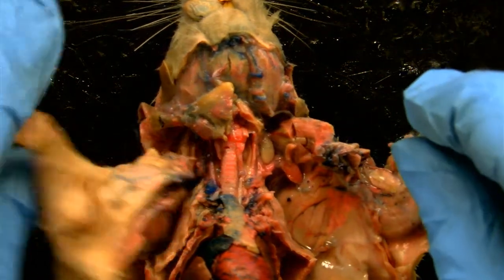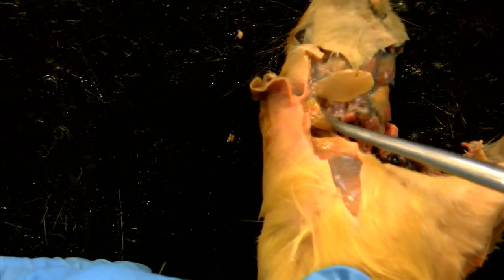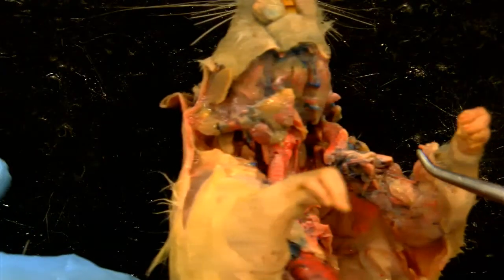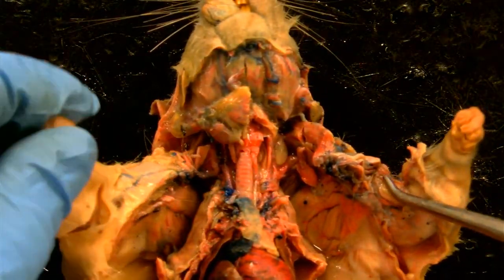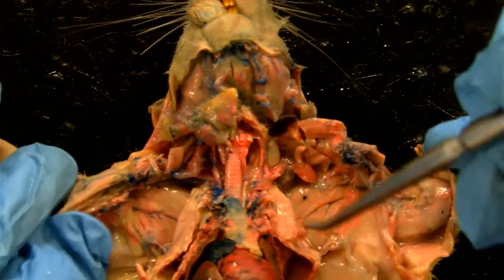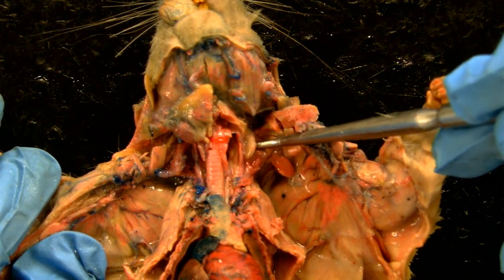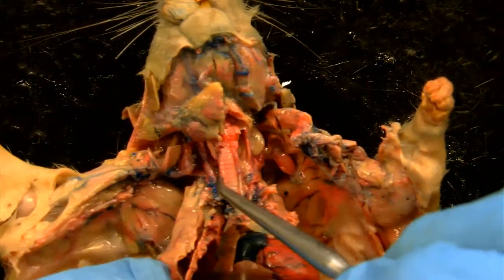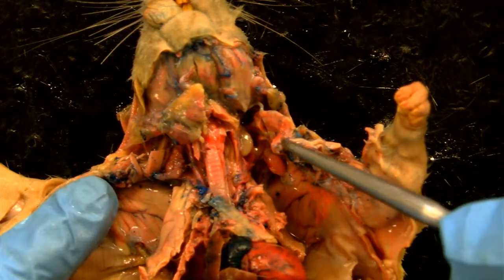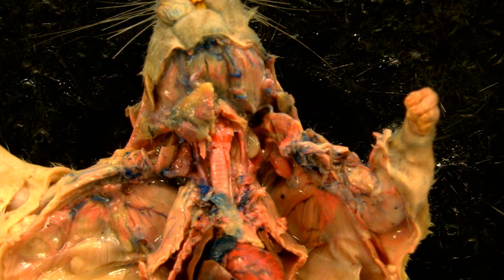Now let me rotate this animal a little bit and show you the parotid gland, which is near the ear of the animal just under the skin. So that's the parotid right there. And there's one last one, called the sublingual. So we have a sublingual gland right here, and there should be two — one on either side of the trachea. So the one on the other side is this tissue here. So those are the salivary glands: three paired sets of glands.